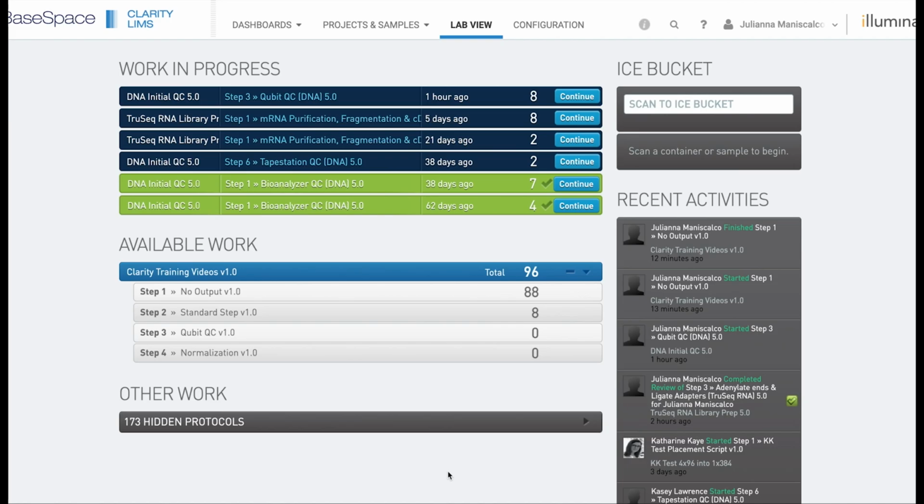Types of custom fields. These are going to be fields that you will need to capture the appropriate metadata to track your samples successfully throughout the lab. In this video, we are going to talk about derived sample custom fields in a no output step. These are going to be your steps where the samples are not being plated into a new container. An example of this would be on the bench where you have samples on a plate, but you are adding reagents to that plate. Therefore, the field set on this step is going to be set on the input sample.